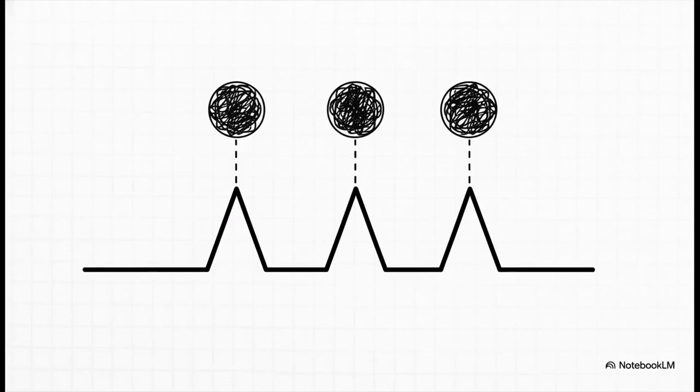Which brings us to a really crucial point. In a standard NMR solvent, like chloroform-d or CDCl3, the carbon atom is directly attached to a deuterium atom. Because those 3 spin states of deuterium are equally probable floating around in the solution, the carbon-13 signal gets split into 3 perfectly equal peaks. I mean, if you've ever run a spectrum and panicked for a second, wondering why your clean solvent singlet looks like a messy 3-line split, take a breath. It's not a mistake. That right there is the 1-1-1 triplet. It's a massive, predictable structural clue of carbon-deuterium coupling, and honestly, one of our prime suspects in the lab.